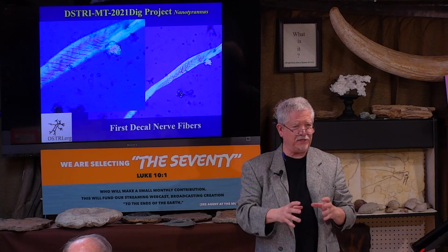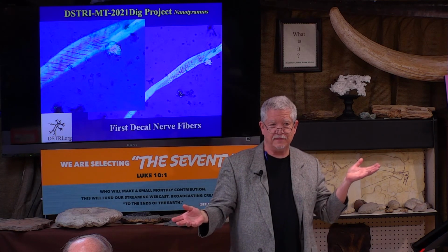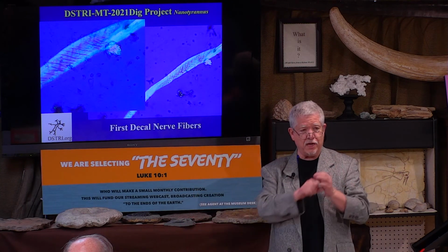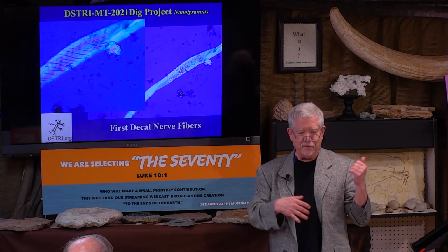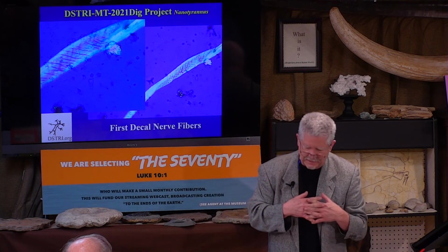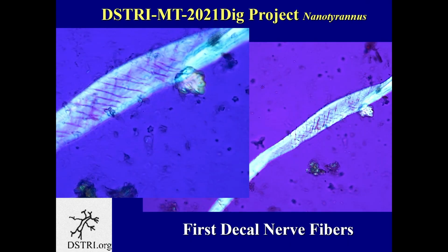That's an insulation around the nerves that transmit electrical signals. Just like your coax cable has a rubber coating on the outside to insulate it, these nerves are insulated with a similar tissue that adopts that same structure. So this is what's called a diagnostic feature. When you see this crosshatch in a fiber that glows in polarized light, you know you have a nerve.